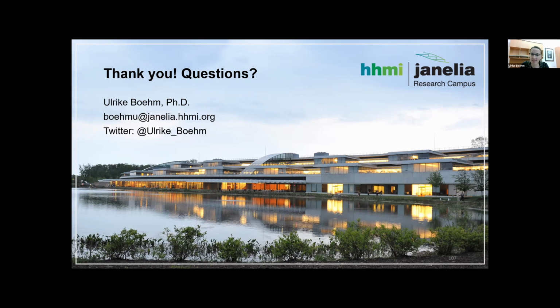And I think that maybe separates the systems which we have here at Janelia, because they have been optimized for stability. You cannot use just any FIB system in the world to scan an entire fly brain; you need to have lots of feedback loops and so on in place. And it's again a very lengthy answer. Why is it so lengthy?